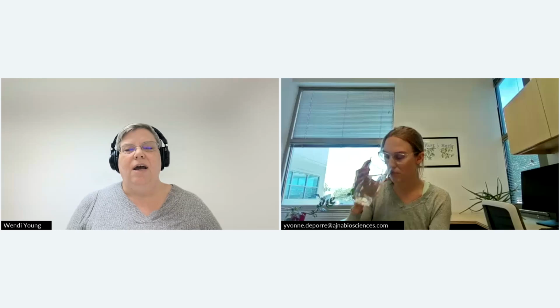Thank you for joining us today for a discussion on impurity identification. This is a topic that can look very straightforward from the outside. You see an unknown peak, you collect some data, and you identify it. But in practice, impurity ID can be one of the most challenging parts of analytical development. It requires strong chromatography, good mass spec and spectral interpretation, a practical isolation strategy, and often a fair amount of patience and scientific judgment.